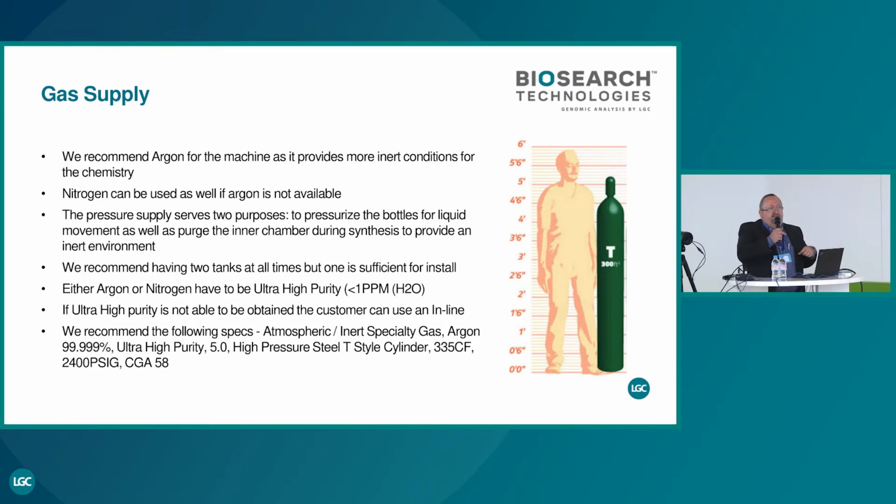When you are doing therapeutics, your oligo is 92%. But the question is, what are the 8%? Or what are the 5%? And what is this peak, and why didn't I see this peak before, and why do I see it now? That's why you have to put in place a very solid process, and to have all the time the same production and the same profile for your HPLC and for your purity. For diagnostic too, but for therapeutics, it's even more important.